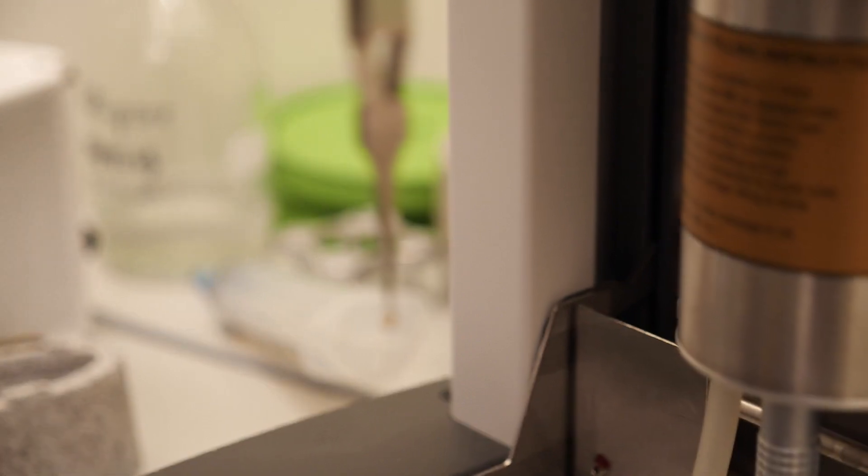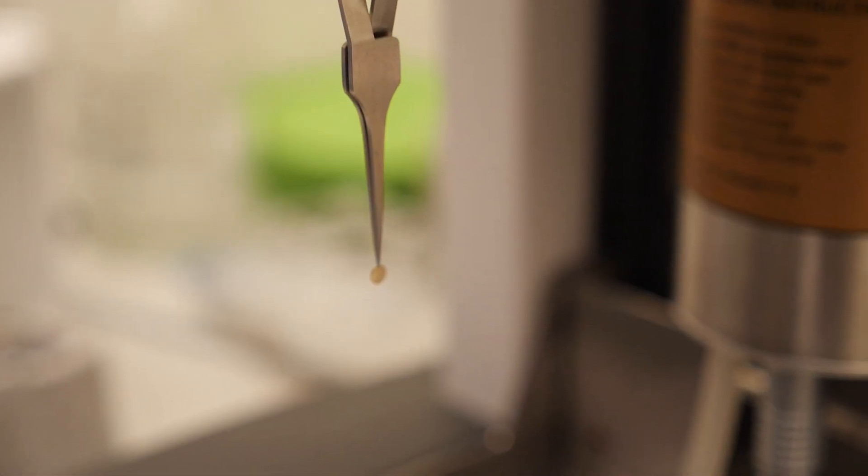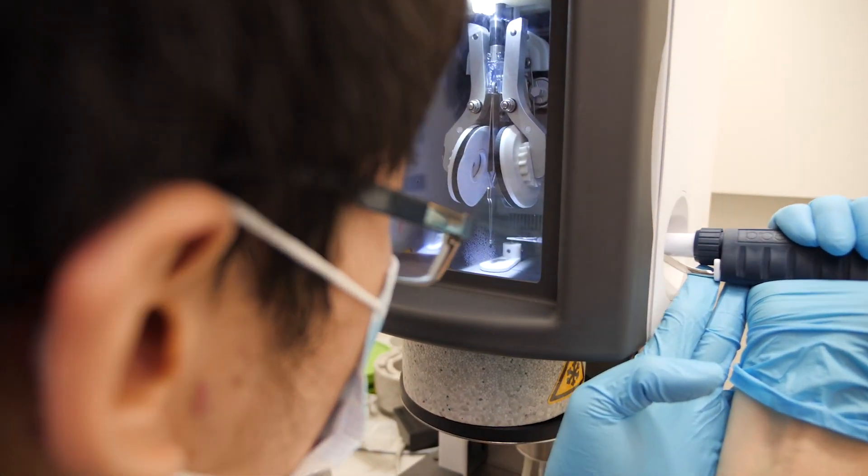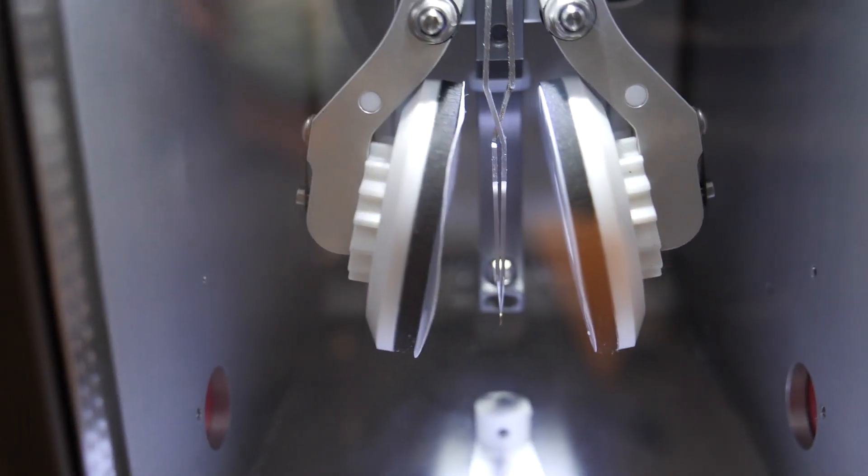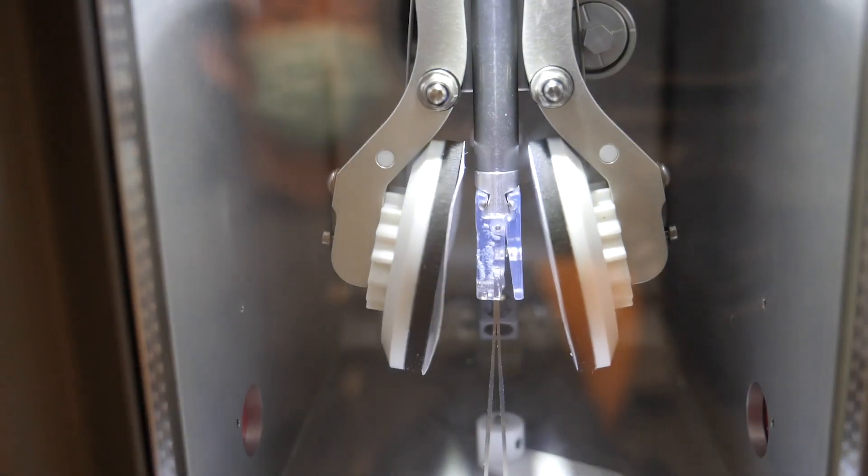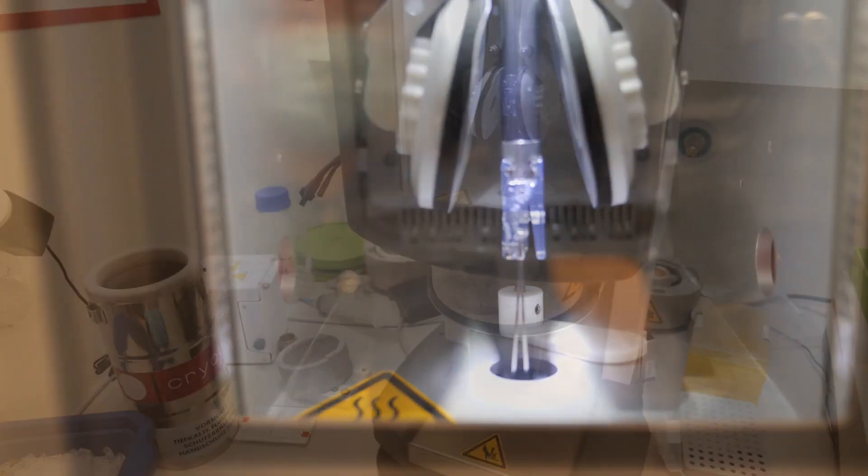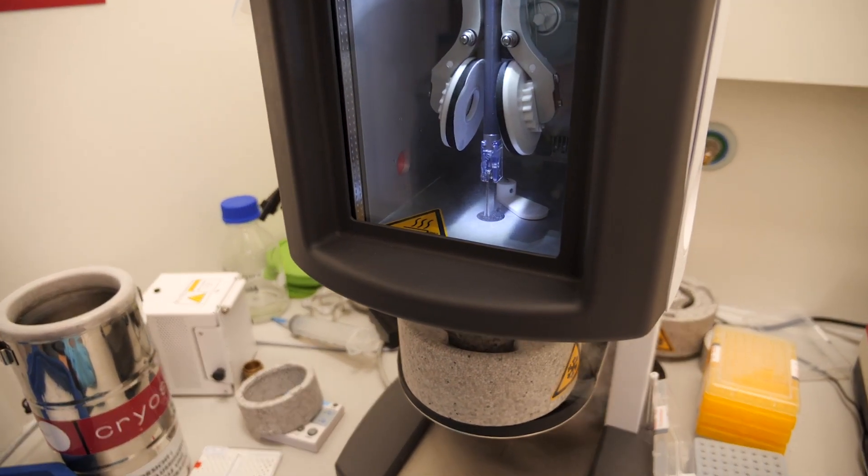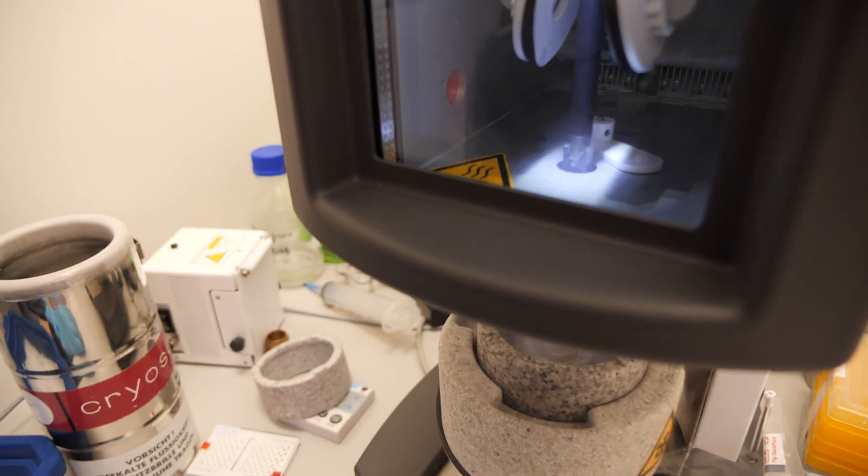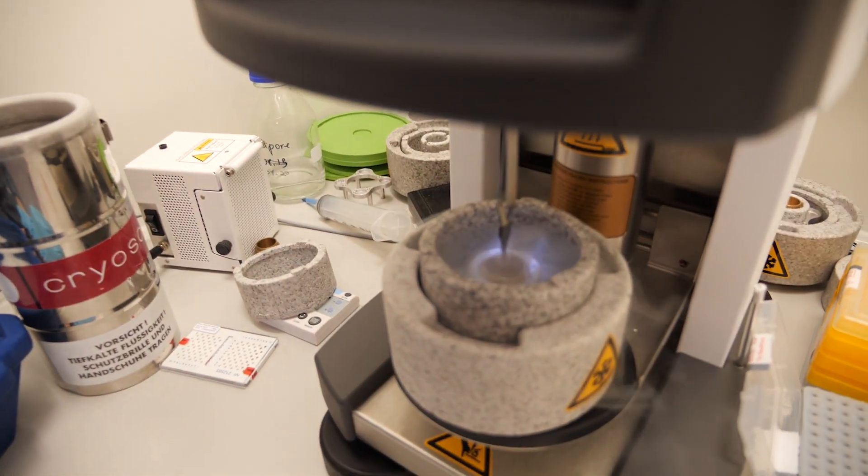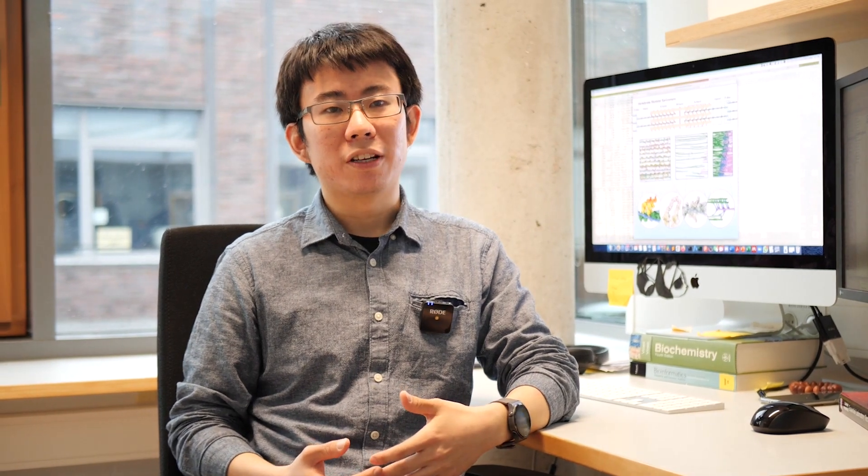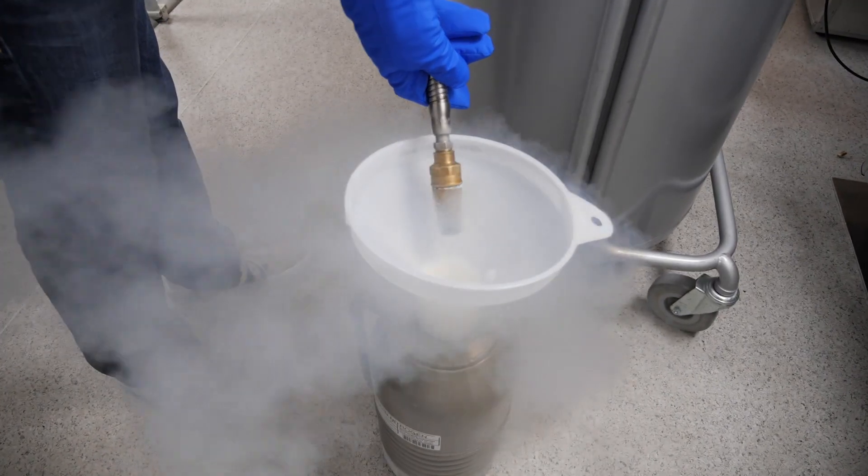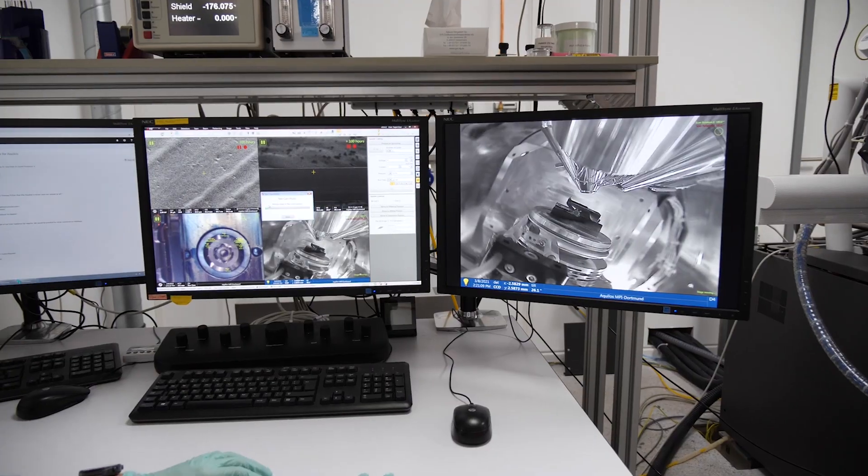The first step in our workflow is now to vitrify the myofibrils on grids by plunge freezing them into liquid ethane below minus 170 degrees Celsius. Freezing occurs so fast that water molecules do not have time to crystallize but enter a glass-like state. Compared to conventional chemical fixation, vitrification preserves hydrogen bond network of proteins and keeps the sample in its native state.